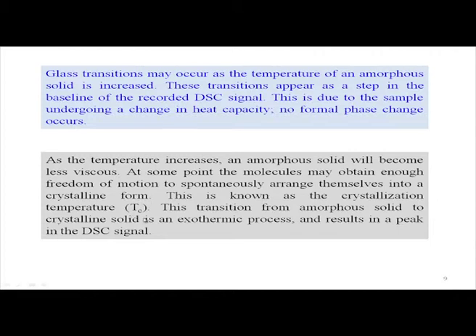So, this TC is now useful to monitor the corresponding crystallization process. So, not only the glass transition, we can also monitor the corresponding crystallization temperature. So, what we get is the change from the amorphous solid to the crystalline solid, because most of the time when we synthesize some new compound, whether at room temperature under stirring or under some high temperature refluxing condition at the boiling point of the solvent, when we cool it down to room temperature or stop the stirring, we sometimes get a crystalline solid compound, but in all other cases we get some amorphous solid.